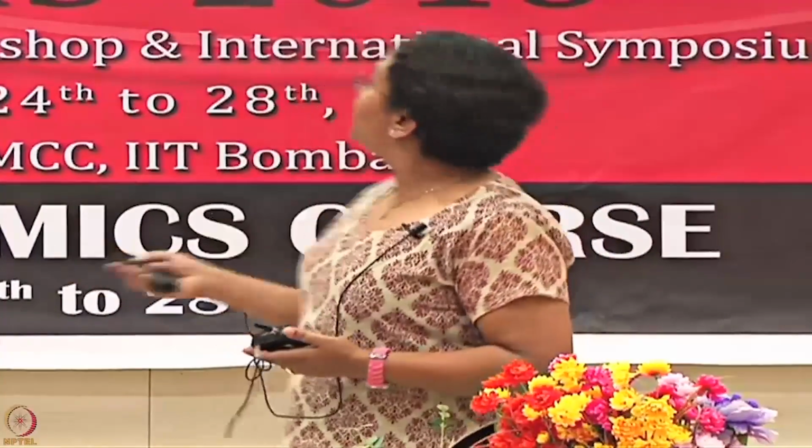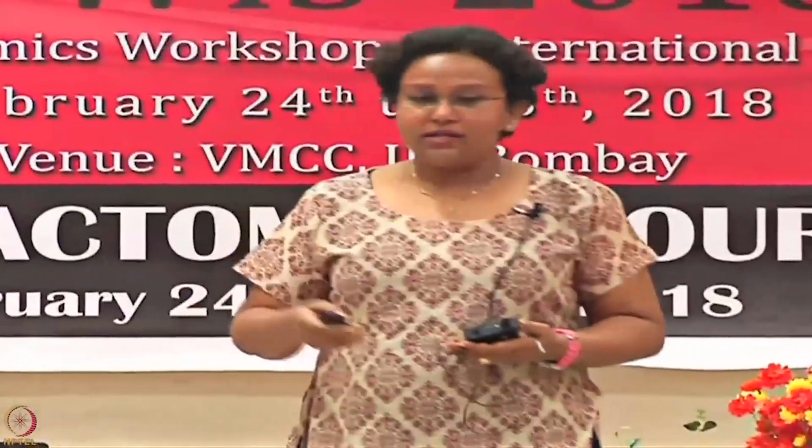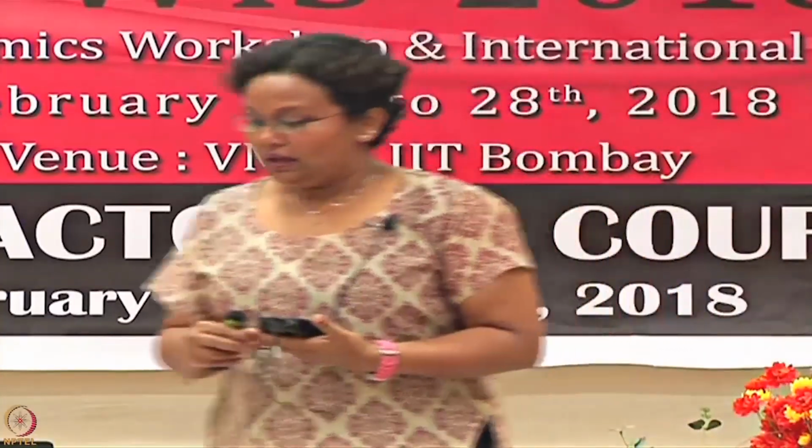If you do not see any rise, for example in these cases, if you do not see any rise at pH 5.5 and 5, and suddenly you see a rise at 4.5, that is where you go to a lower pH like 4.5 or 4. Otherwise, stay close to a more comfortable environment. Does it make sense? Okay.